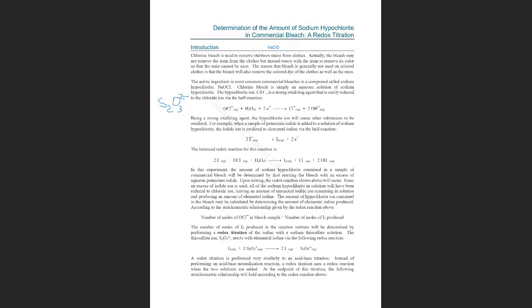Our sample will be in a flask here, and we will have the burette.